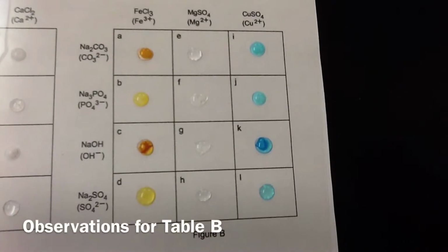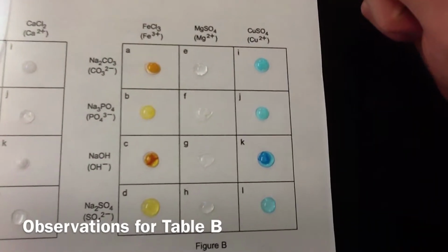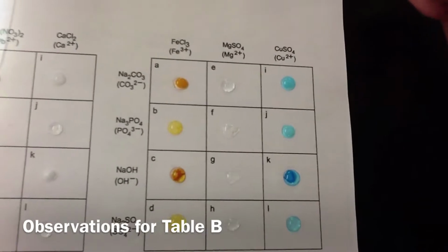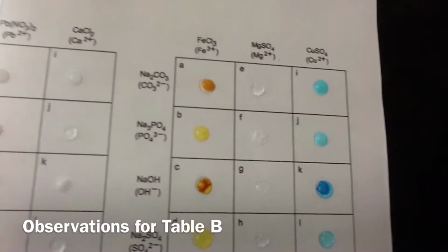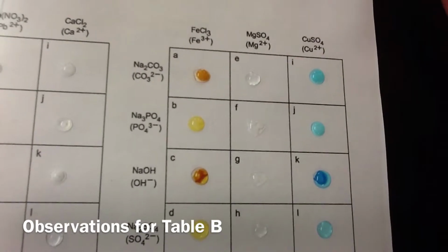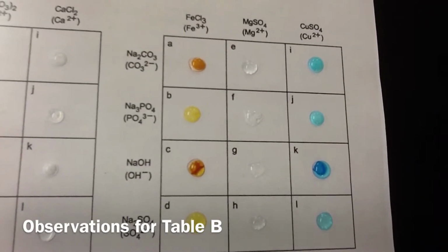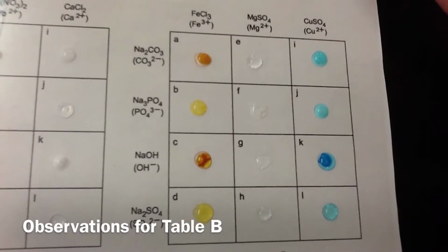So when we mixed the compounds in Figure B, we found that when FeCl3 mixed with Na2CO3, it formed an orange precipitate. When FeCl3 mixed with Na3PO4, it did not create a precipitate. However, there is a little bit of milky substance, which leaves us a little unclear. When FeCl3 mixed with NaOH, there was definitely a precipitate that formed. There is an orange precipitate, and it's a little cloudy. And then when FeCl3 mixed with Na2SO4, no precipitate was formed.